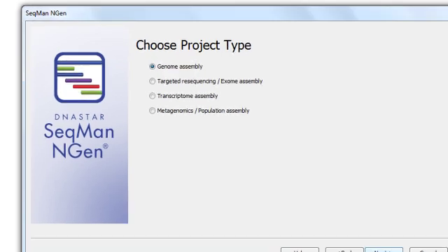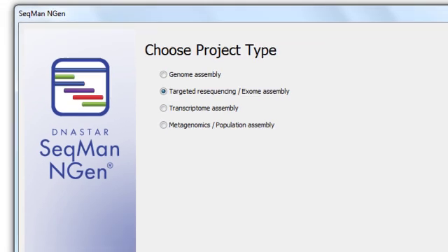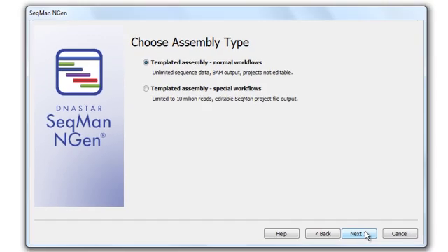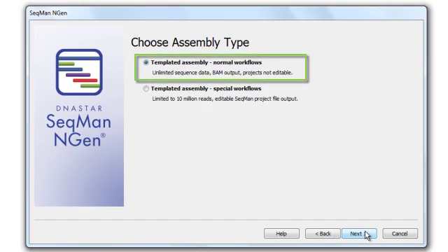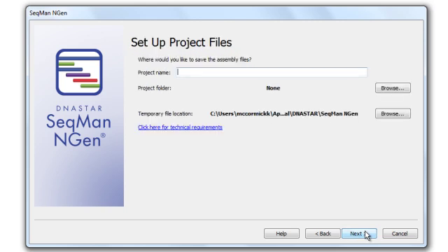For Project Type, I want to choose Targeted Re-Sequencing, and then click Next. I'm going to leave the assembly type set to Templated Assembly Normal Workflows, and then click Next.